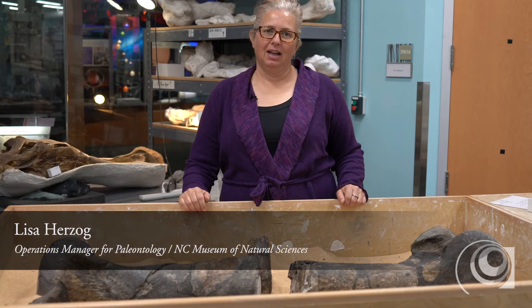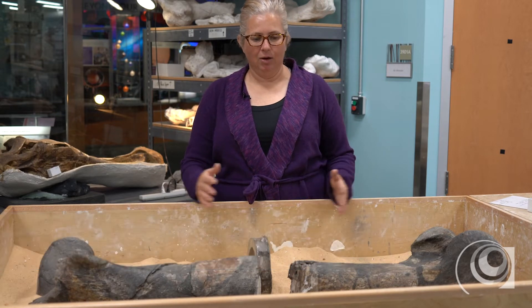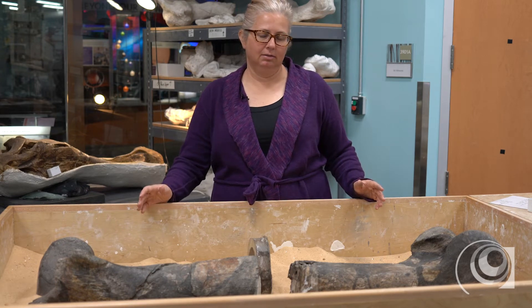Hi, my name is Lisa Herzog. I'm in the paleontology research lab here at the museum. And in front of me, laid out, I have a femur of a fossil theropod dinosaur known as Acrocanthosaurus.